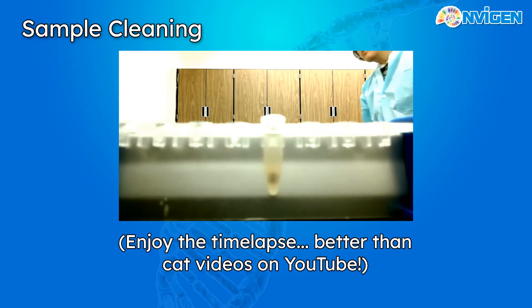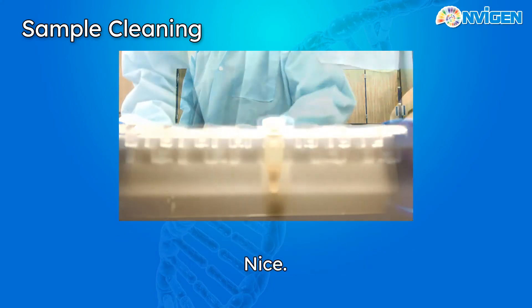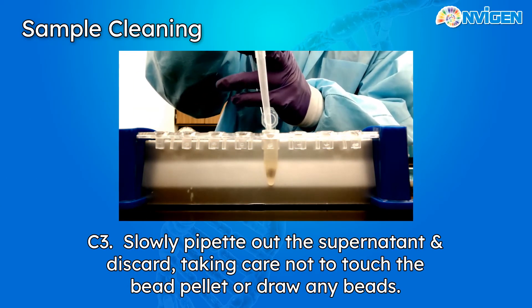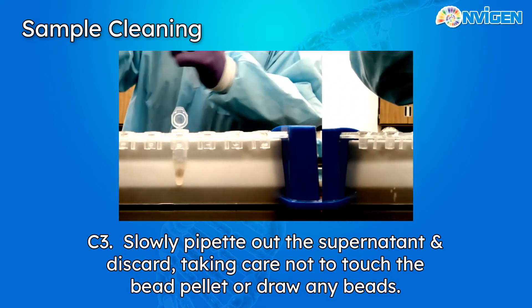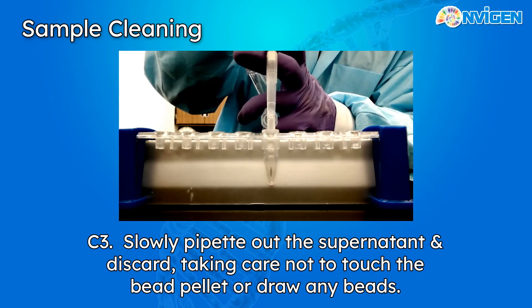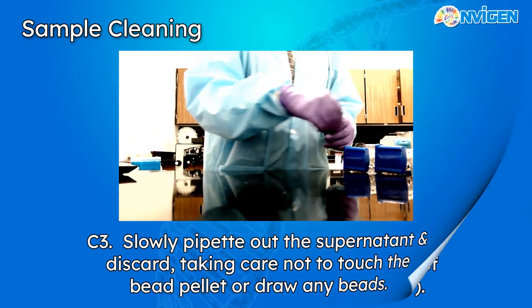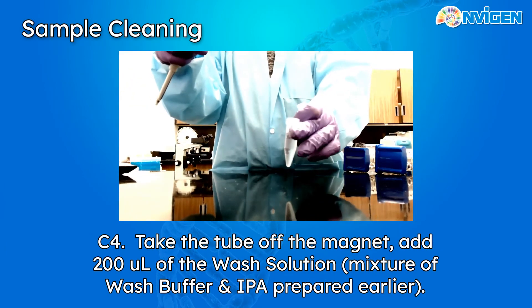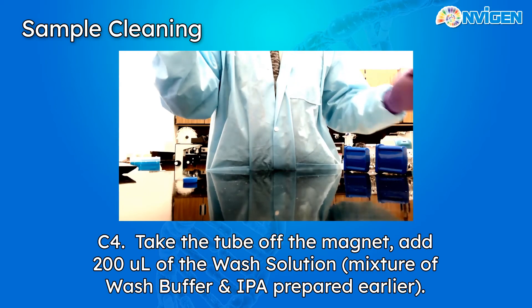The CFDNA we're trying to harvest has now been bound to the beads, so all we have to do is remove and discard the supernatant. Be sure to leave the tube in the magnetic rack, or attach it to a neodymium magnet to help keep the bead pellet in place during this process. To clean the beads, we'll first be rinsing them with the wash buffer plus isopropyl alcohol mixture we made at the beginning. For a 500 microliter plasma extraction, we'll be using 200 microliters of wash buffer.